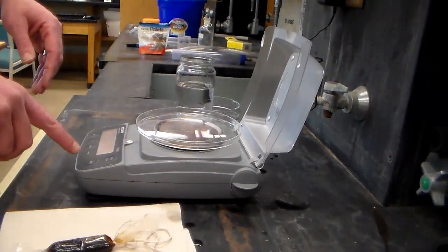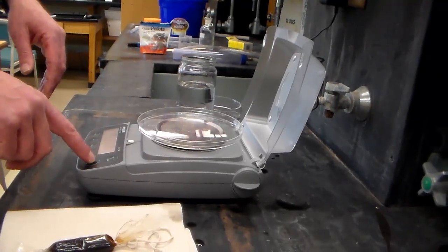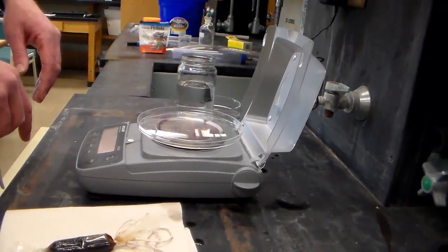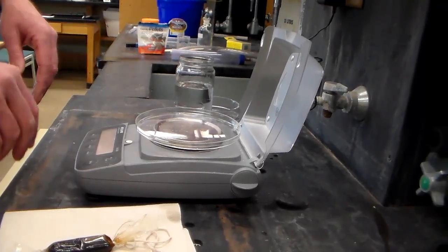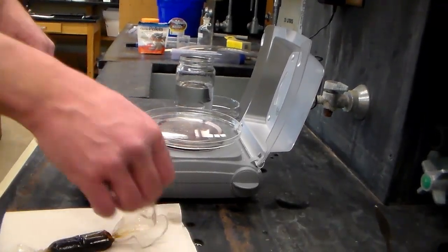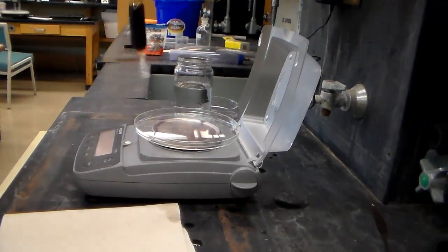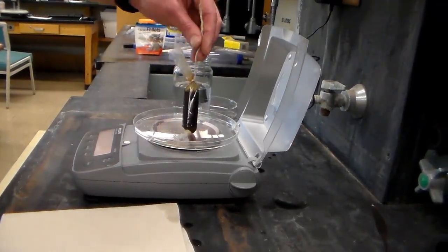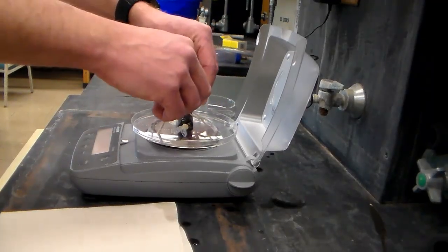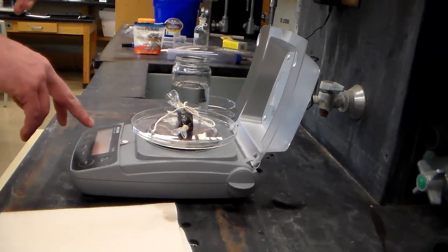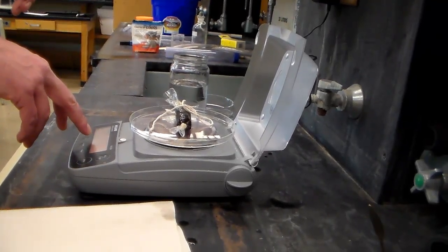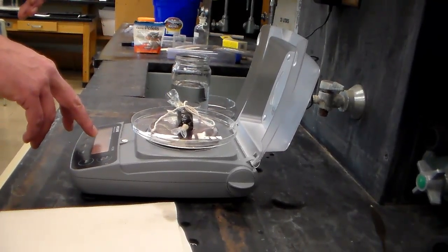So once it settles down a little bit we'll hit the zero button or the tare button, and now it should reset back to zero. So that's removed the weight of that tray, so now when we put this in we're just getting the weight of the dialysis tube. Carefully set that in the center. Make sure you put the string all in the tray as well. And then record the weight to at least one tenth of a gram.